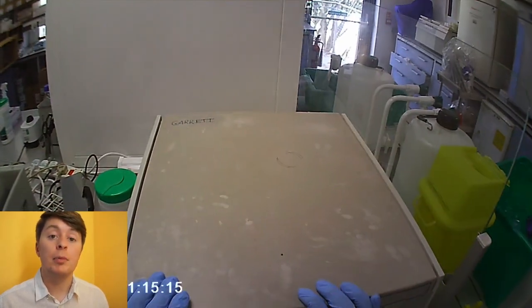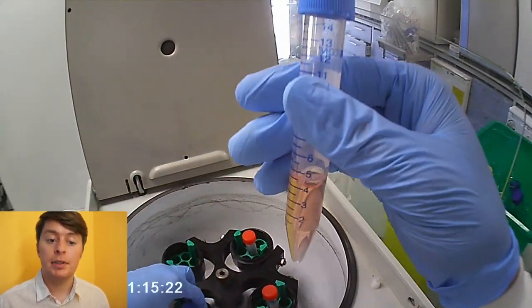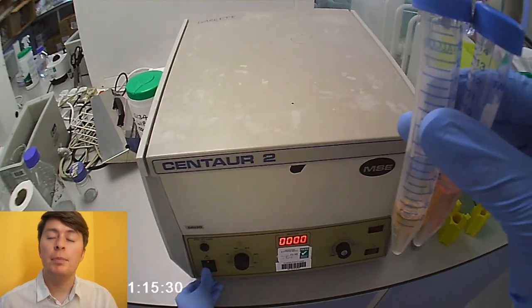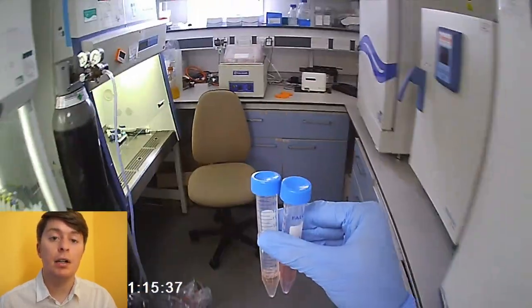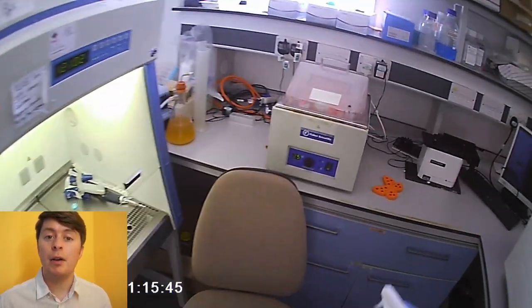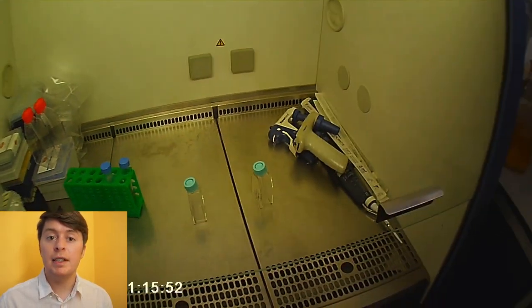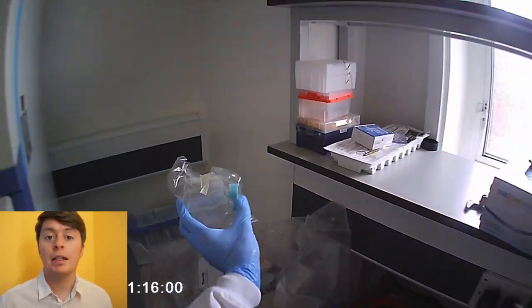Because we're in a shared lab, there's a lot of shared utilities. One of the shared utilities was this centrifuge. This centrifuge looks a bit outdated, but it was perfect for what we wanted, which was a low G-force to pull our cells out of suspension and deposit them at the bottom. For this, we were using quite skinny Falcon tubes because we were only using, I believe, about 1 to 2 mL of frozen Jurkat cells, which were concentrated down when I initially froze them. We want to put them directly into the skinny Falcon tubes, which are about 15 mL capacity, and just get that pellet forming. Then we can remove that supernatant, resuspend in our lovely clean media, and hopefully everything should be good and we'll see some cells growing within the next couple of days to weeks.